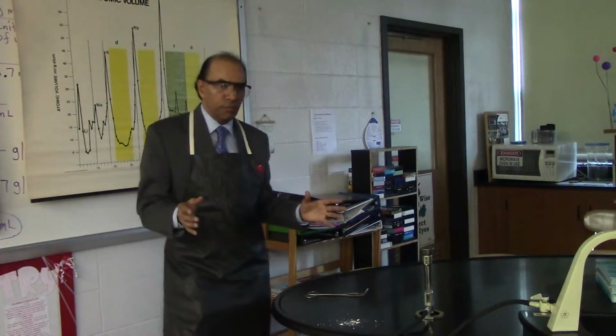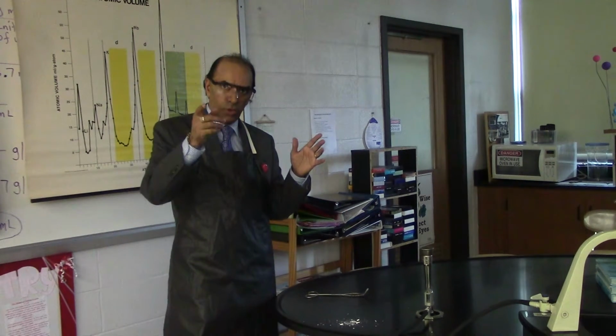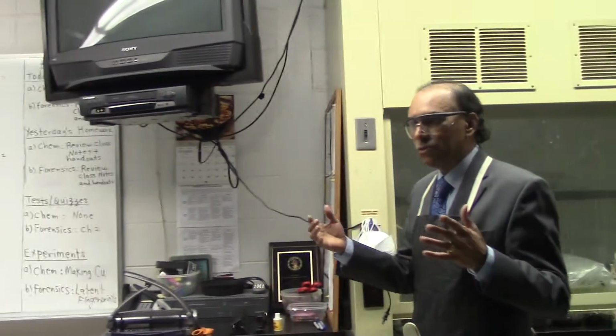All right, so that's a simple experiment. It's burning a magnesium ribbon. I'm now going to go up to the board and we'll have a look and see what the equations look like for this particular reaction.